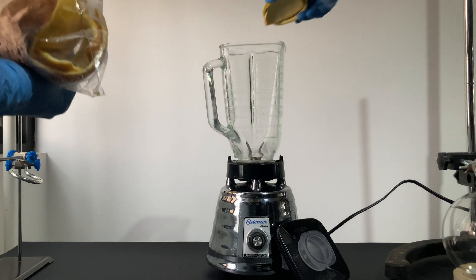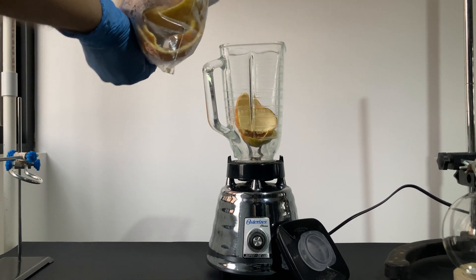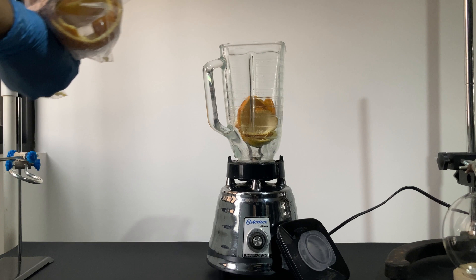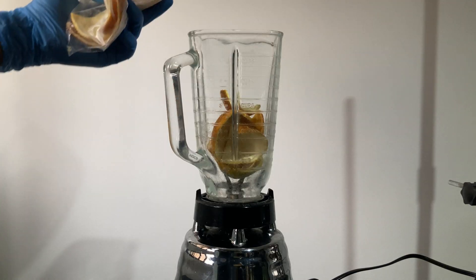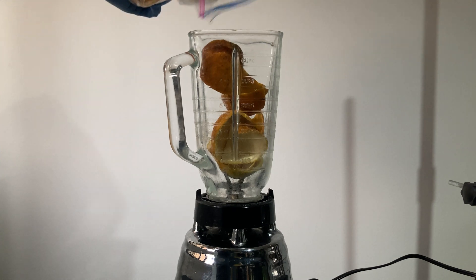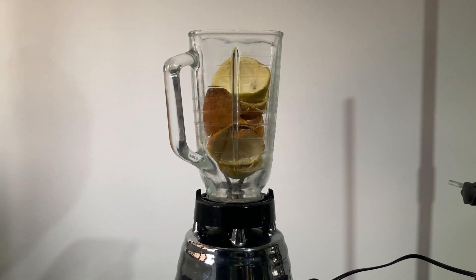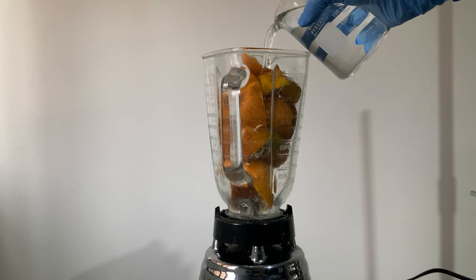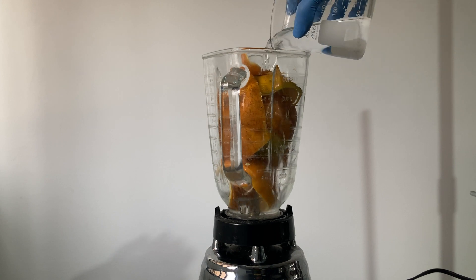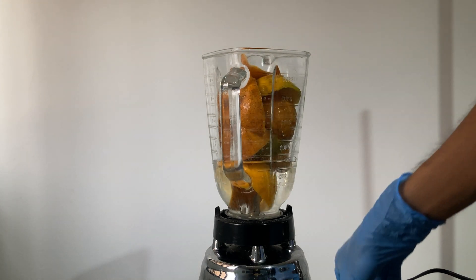Normally, people used to manually grind the flavedo from the fruit. However, I decided to take a lazier approach and just use a blender. I added the peels after manually removing the albedo — I actually didn't know any of these words before this video. In my case, the peels were stored in the freezer for a couple of days and honestly, I didn't take the time to unfreeze them.